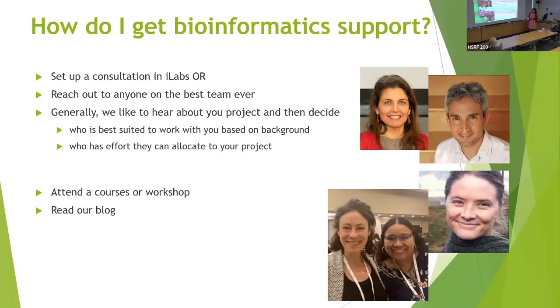Generally our processes will participate in a consult depending on what you filled in your iLabs request, and we'll assign a bioinformatician who has the most experience or expertise in that particular domain to be part of that consult and probably ultimately work on your project. And it also depends on who has effort available at the time.